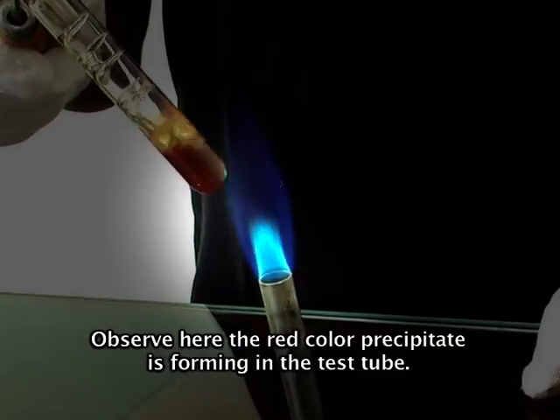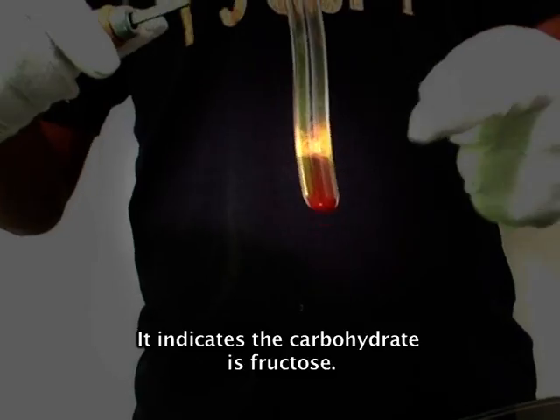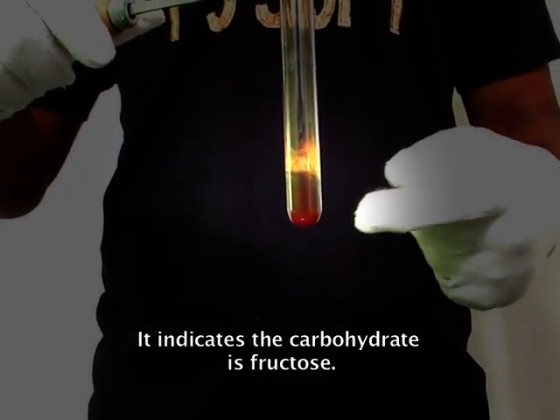Observe here: a red color precipitate is forming in the test tube. This indicates the carbohydrate is fructose.